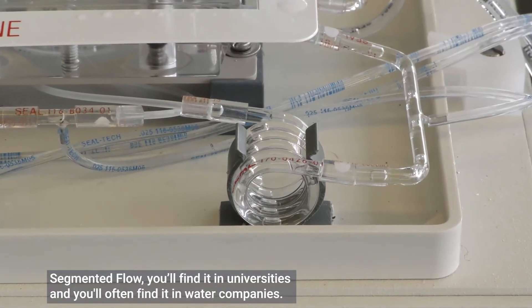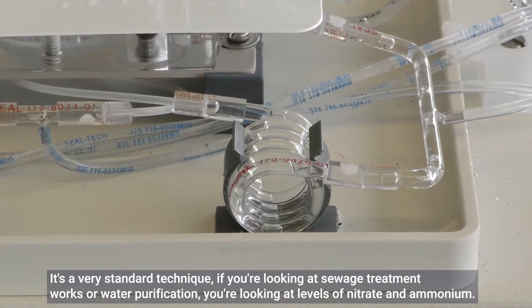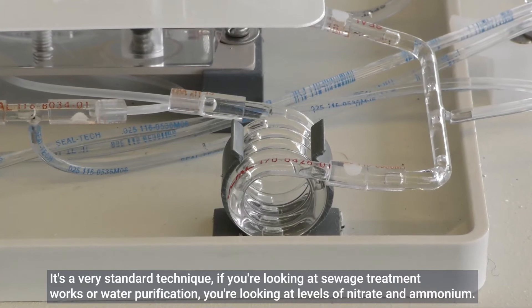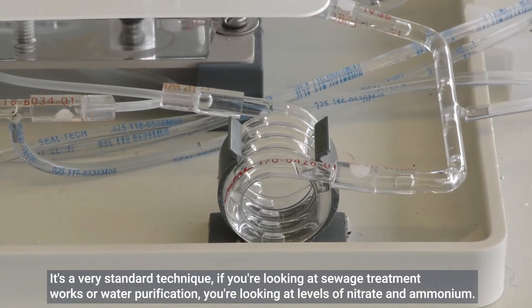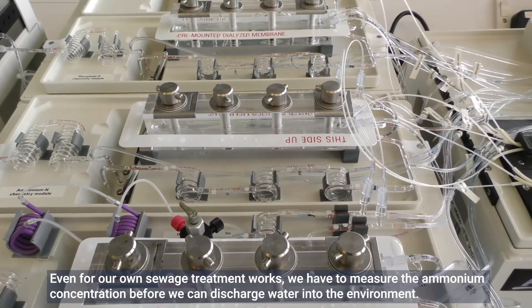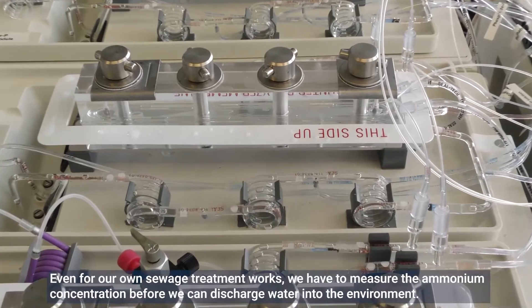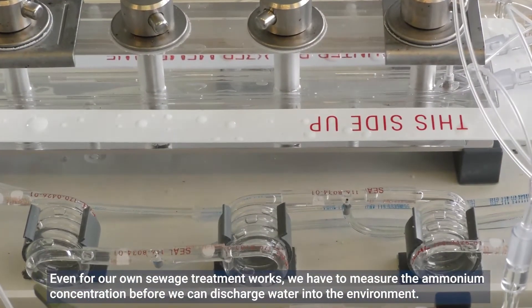Segmented flow analysis is found in universities and water companies. It's a very standard technique if you're looking at sewage treatment works or water purification and measuring levels of nitrate and ammonium. Even for our own sewage treatment works, we have to measure the ammonium concentration before we can discharge water into the environment.